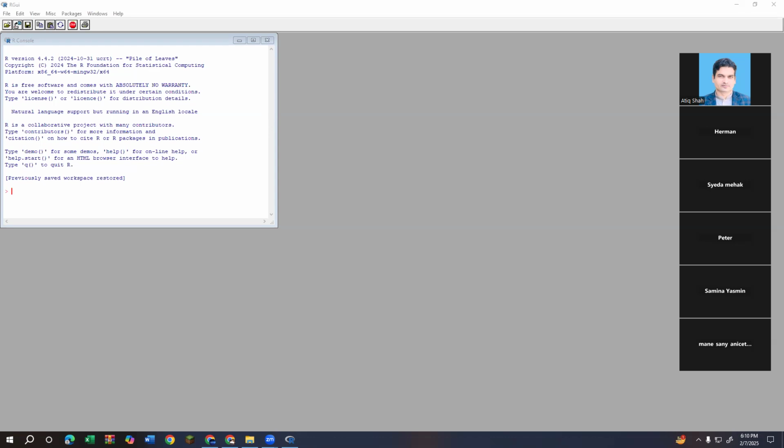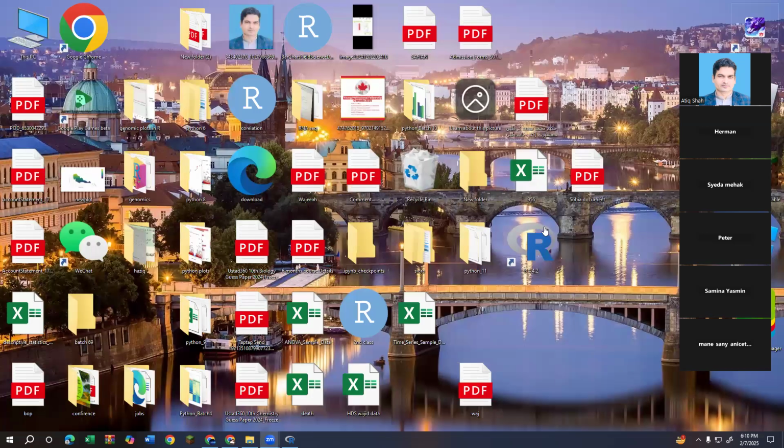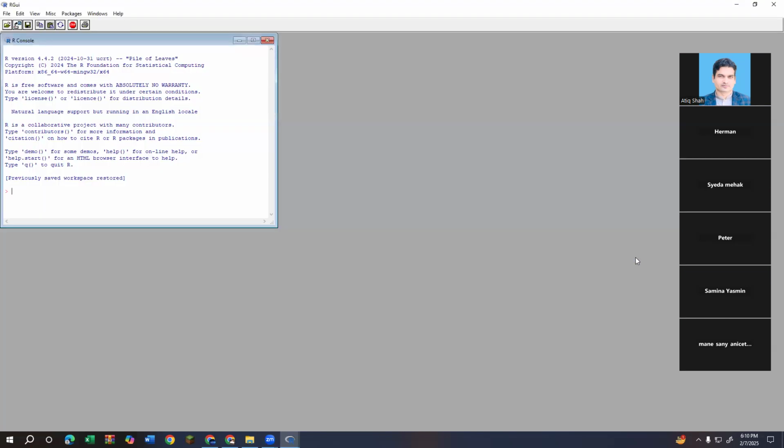Only two participants replied done. So please all participants open this tool. It is found on your desktop, R 4.4.2. Click on this button. It will show you a screen like this, a page like this. Only three participants' messages are done. Please all participants reply. You are 8 participants.